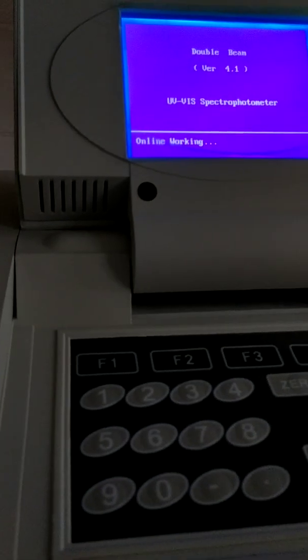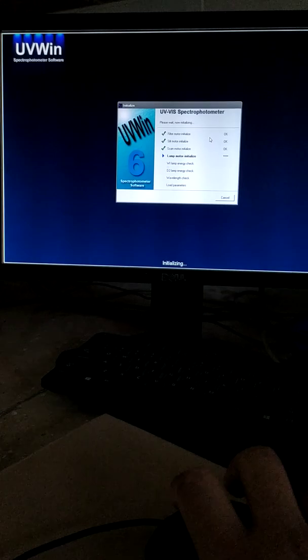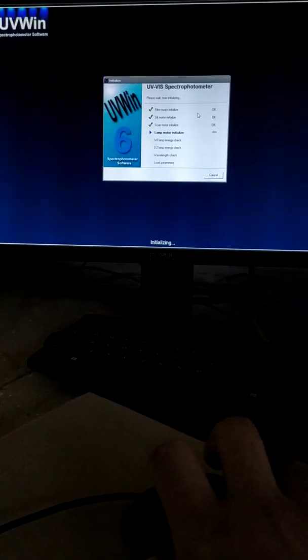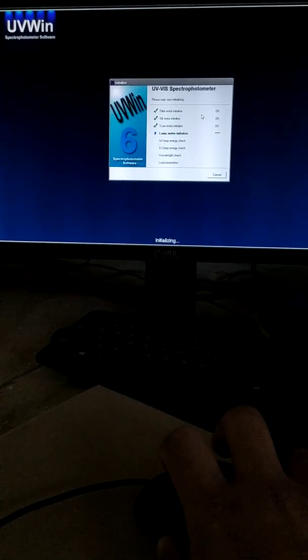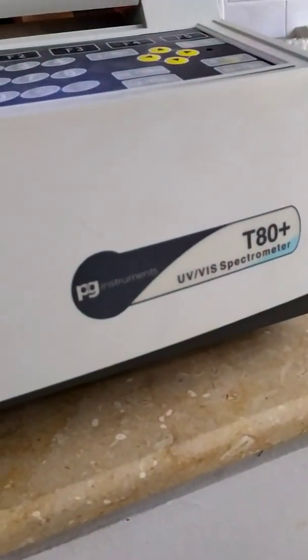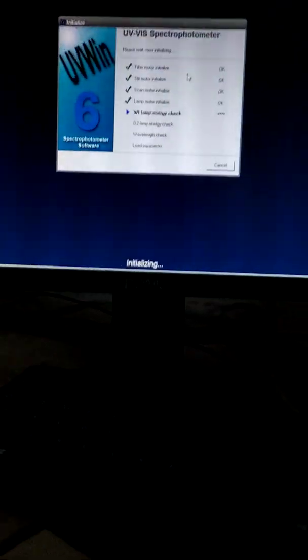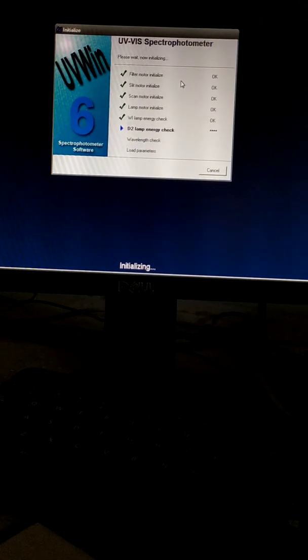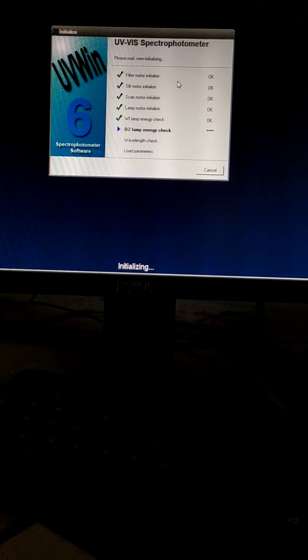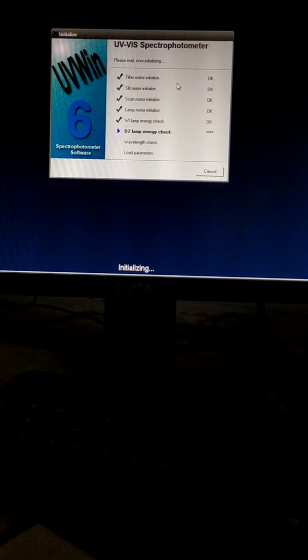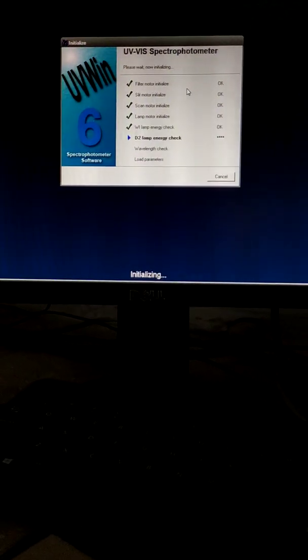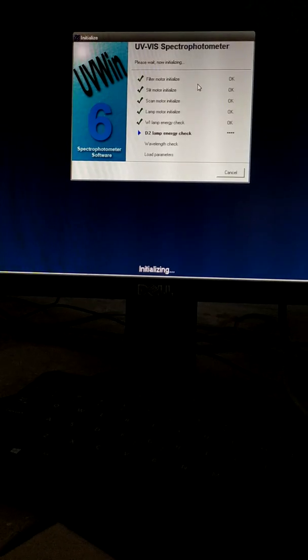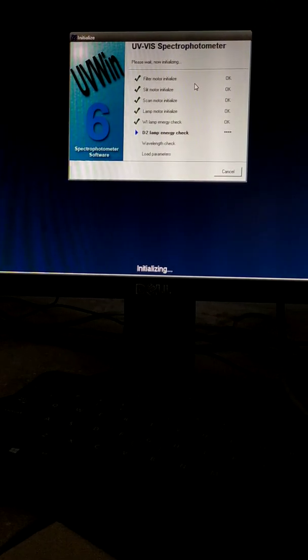Connect the USB cable from PC to the spectrophotometer. It will check all the parameters in self-testing mode. When it completes, I will continue.